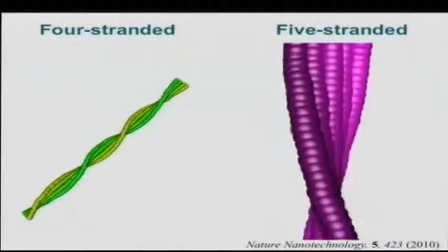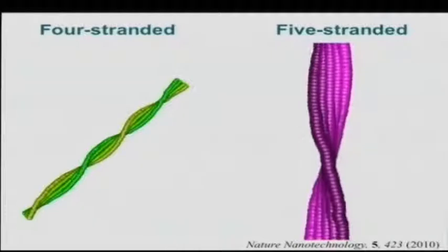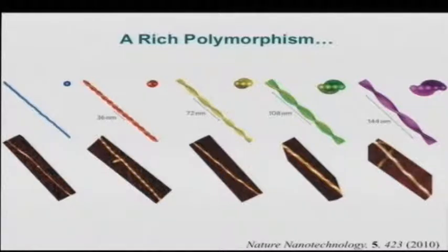So the way we got here is just to apply systematically atomic force microscopy, understand how the persistent length and the height are scaling with different cross-sections, and so on. So this is actually very long work. This is a bit of a summary of this work. You see, these are the AFM images, and we can reconstruct in each case the structure of the fibrils. So this is a very rich polymorphism.